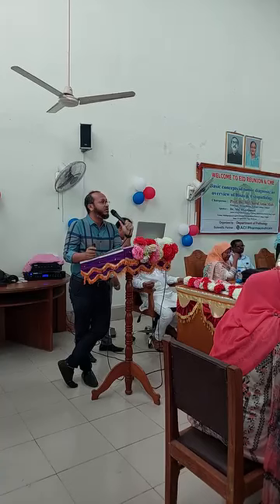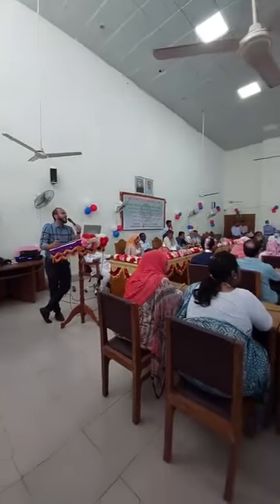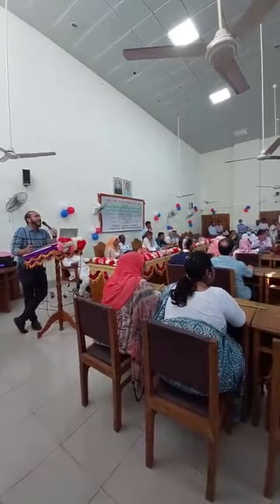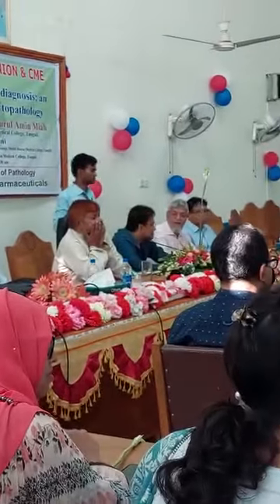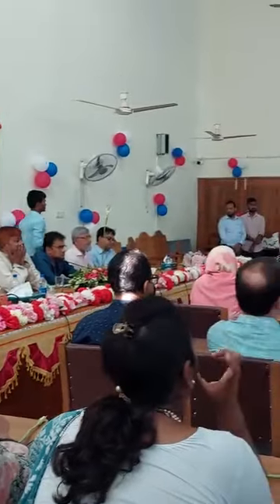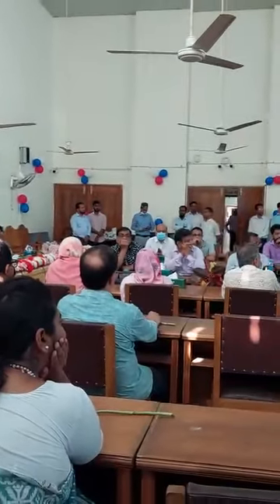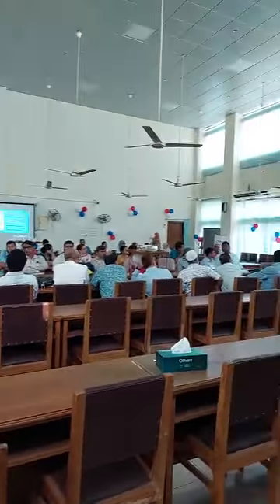What is histopathology? It is the examination of the biopsy or surgical specimen by a pathologist, after the specimen has been processed and histological sections have been placed onto the glass slide. After the operation has been done, surgeons send the specimen to the histopathological laboratory in 10% formalin. Here I should mention that the surgical specimen or biopsy sample should be fixed with 10% formalin.